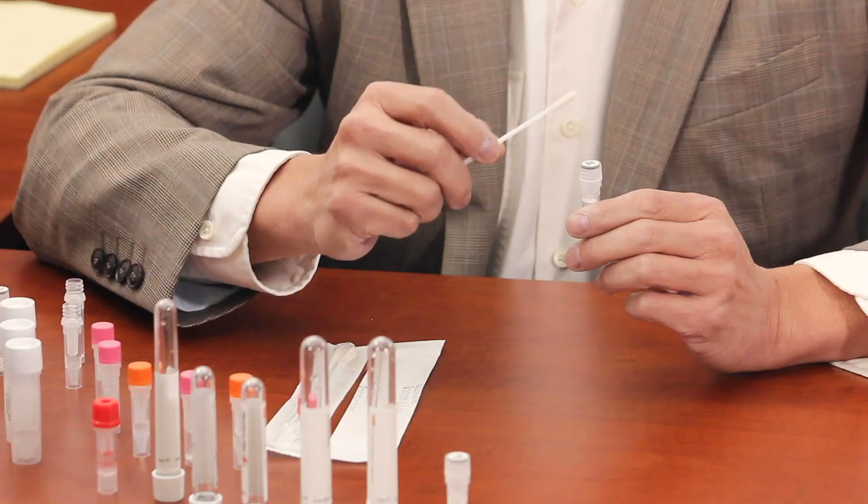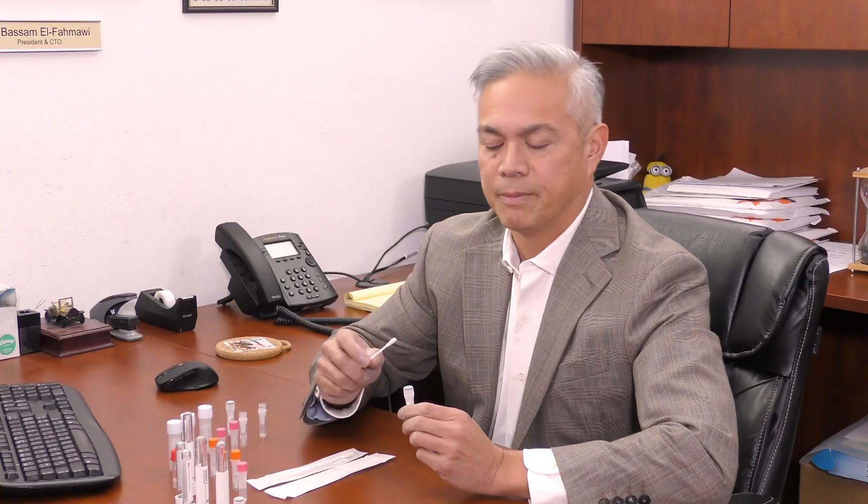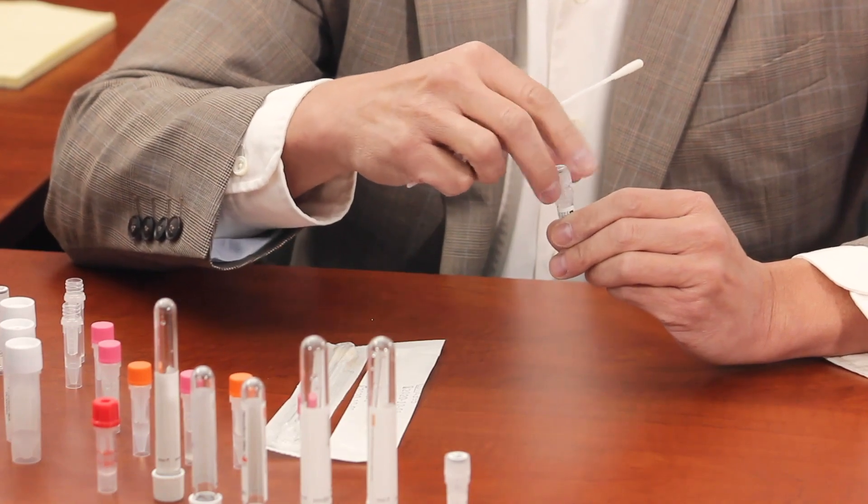Now I'm going to demonstrate to you how to collect the sample using iSwap. The first step is to swab yourself or the subject thoroughly for about 10 to 15 seconds.